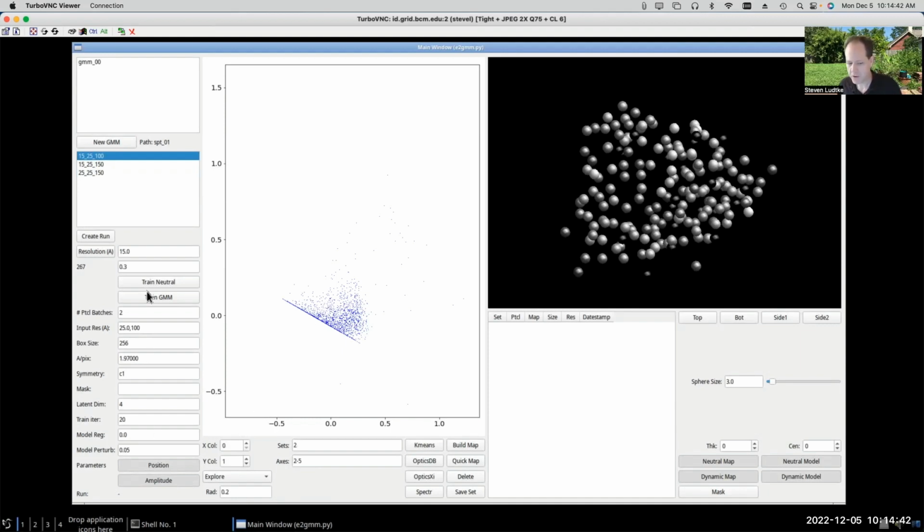But there's a possibility that you might have to tweak some of the parameters. The tutorial does explain some of the parameters, at least in some detail, and I'm going to continue working on the tutorial over the next week while you're using it. But for the moment, it is what it is.